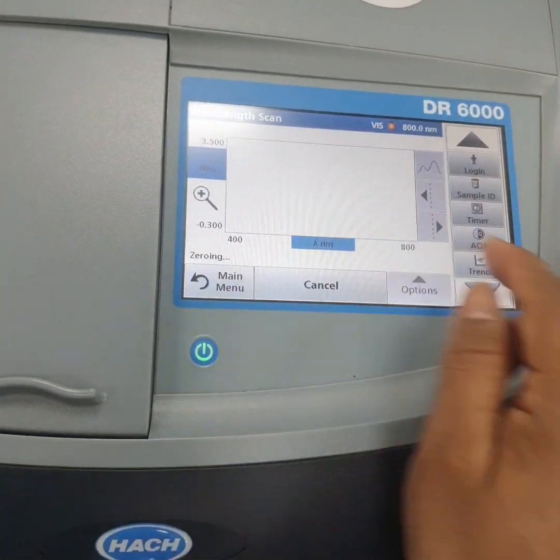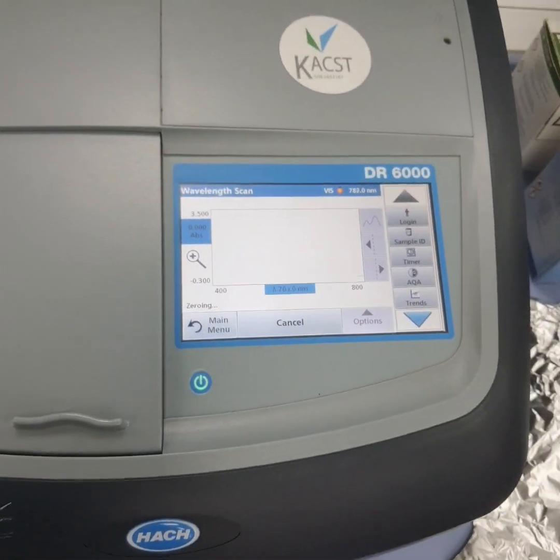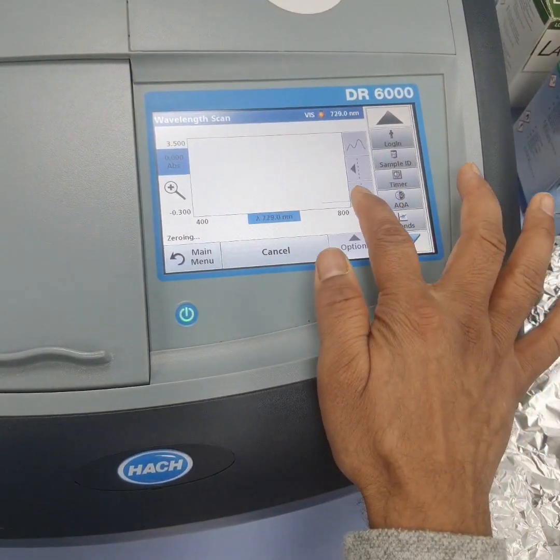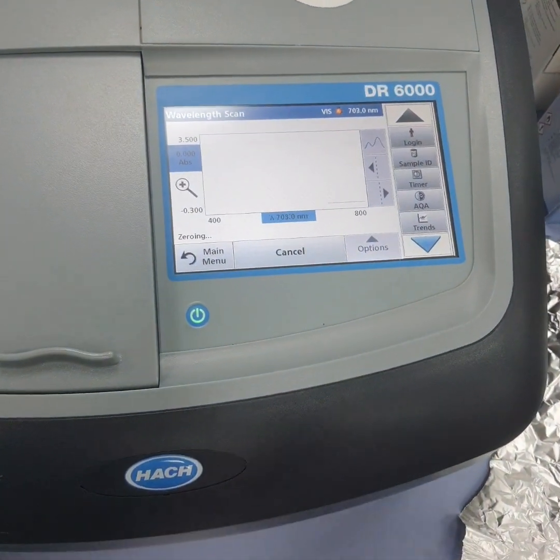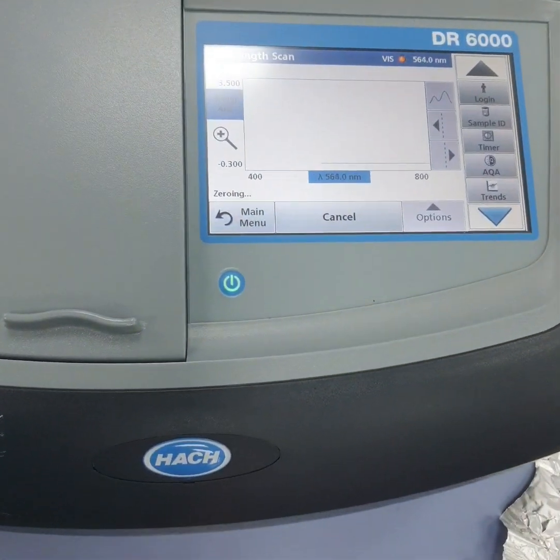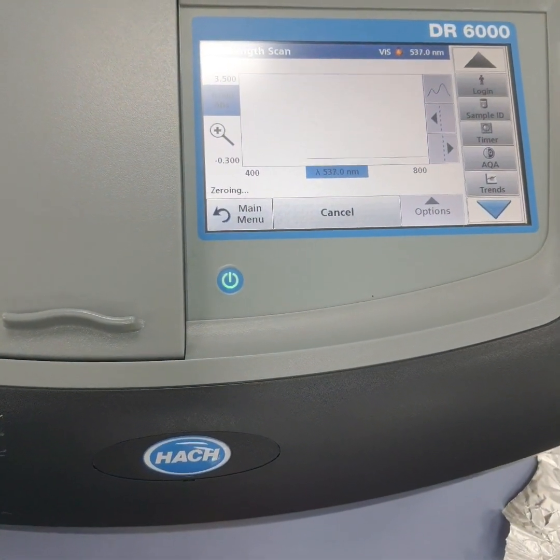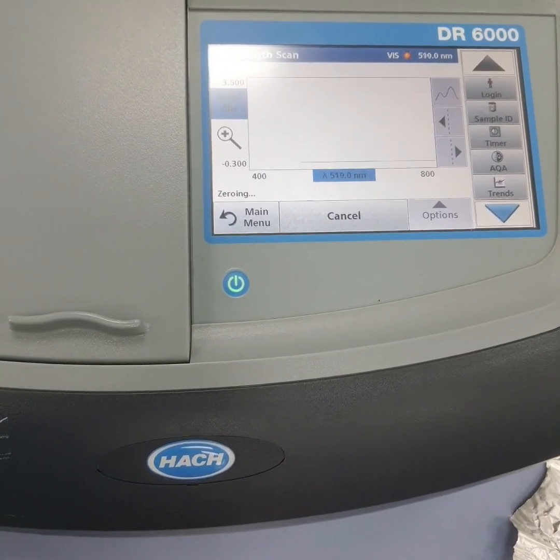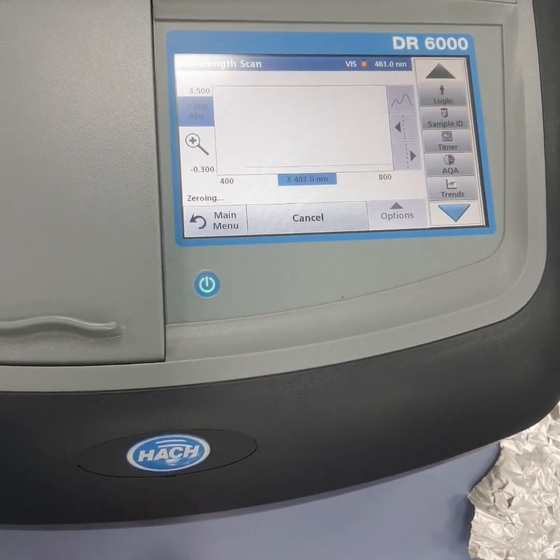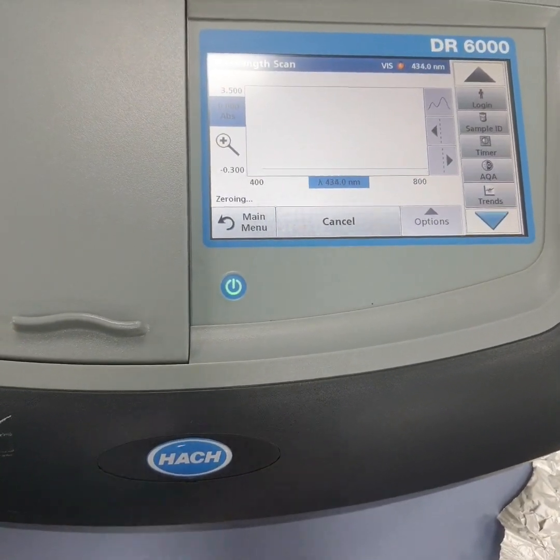When you zero, there is a line which will be straight. When there is water, there are no peaks, so it will be straight. Can we try something else? I'd like to see the wavelengths. Yeah, I will just show you, just wait.